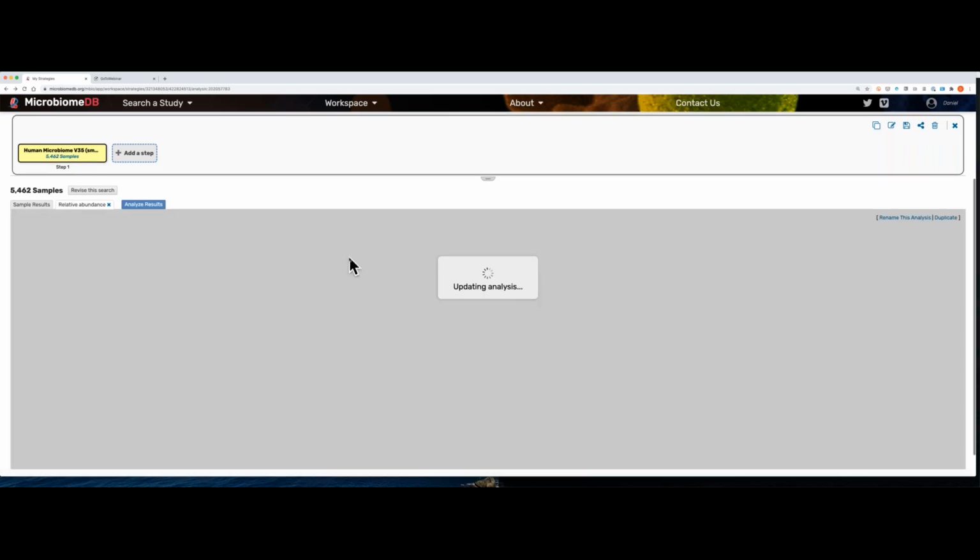That's going to launch in the browser. Depending on how much data you're passing to these apps and the particular app you're working with, there may be quite a lag while these apps load. Remember, in this case, it has to consume over 5,000 samples. So we're going to have just a moment here while this app fully loads. You can see it's telling us it's loading, and it'll display in just a moment. In the meantime, this is a good chance to check and see if there are any questions.